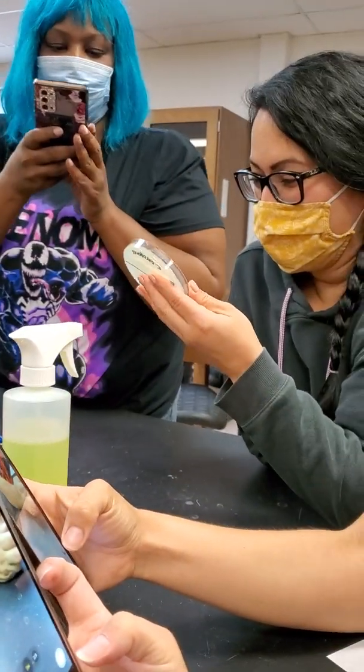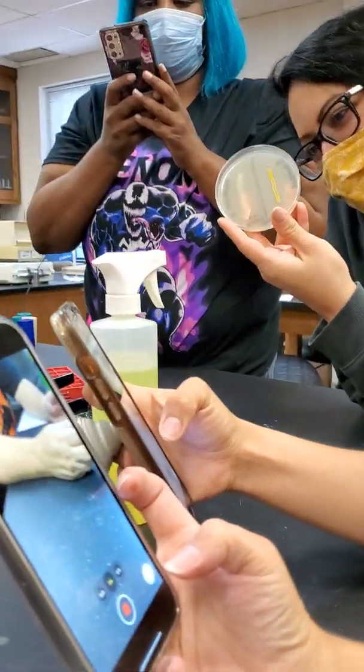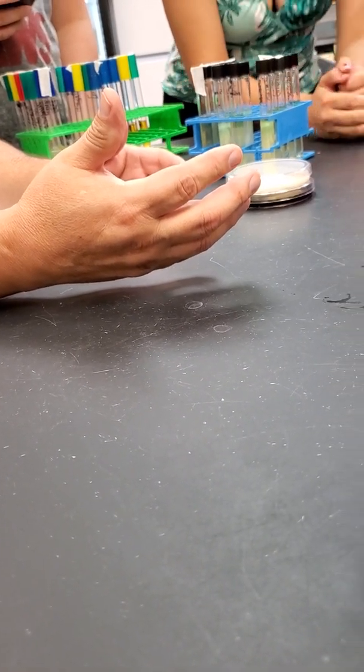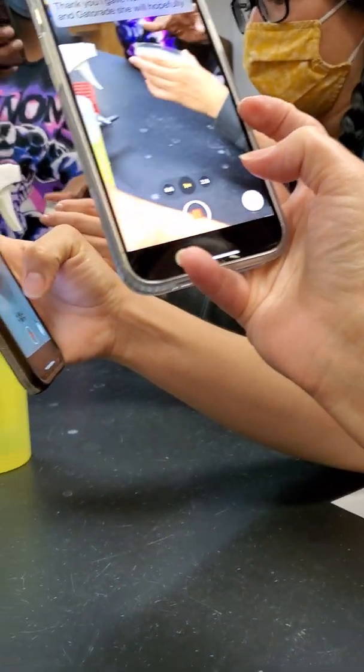It's also Staph aureus producing this really... Wow, it does smell like cheese. So it's just a very small change, because we put it in the refrigerator very quickly, so it didn't have time to go crazy.